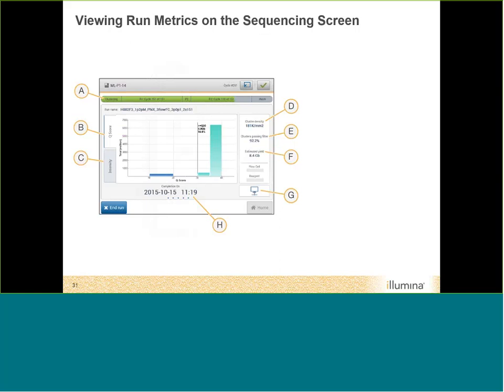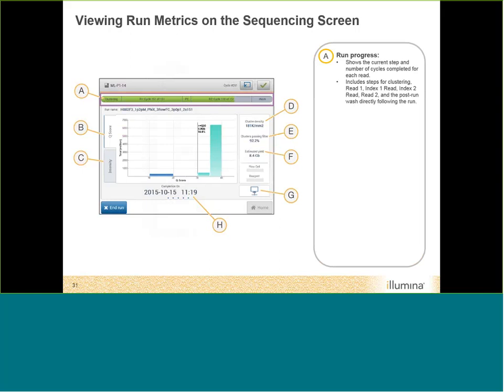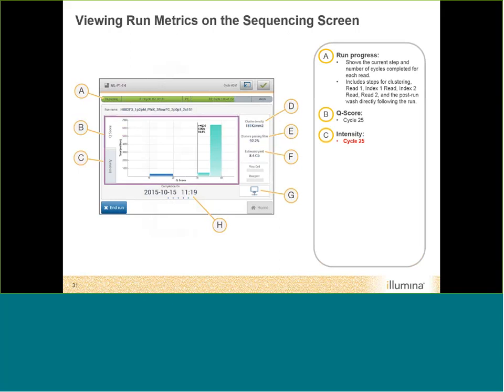Here is a picture of the sequencing screen during a run. Point A shows run progress — a progress bar indicating clustering phase, read, paired-end turnaround, index reads, and wash. Point B shows reported Q scores as a cumulative report. Point C shows reported intensity. In the MiniSeq control software, intensity scores are not reported until cycle 25 — unlike some other instruments where they appear around cycle 5 to 7. So don't be alarmed if you're at cycle 12 and don't see intensity scores yet. After cluster generation, you get cluster density information, clusters passing filter, estimated yield in gigabases, and data transfer status.